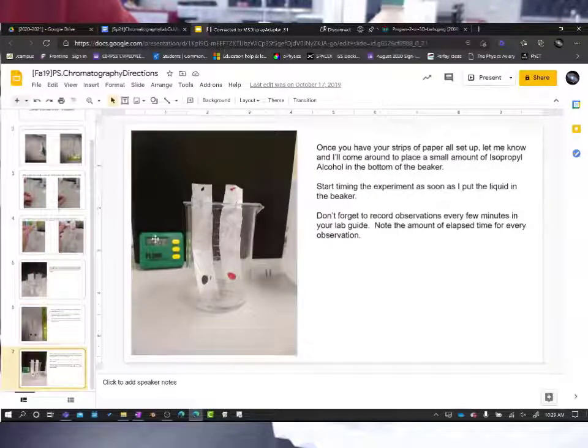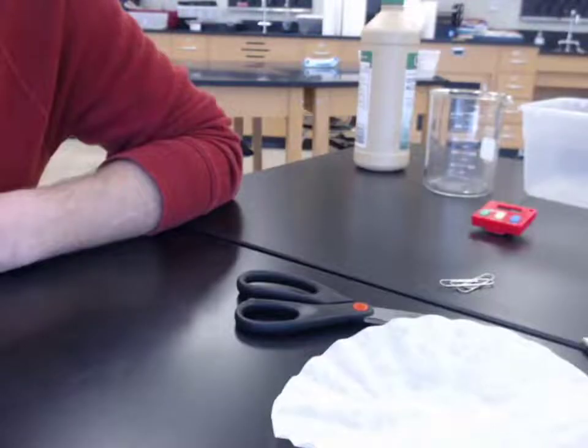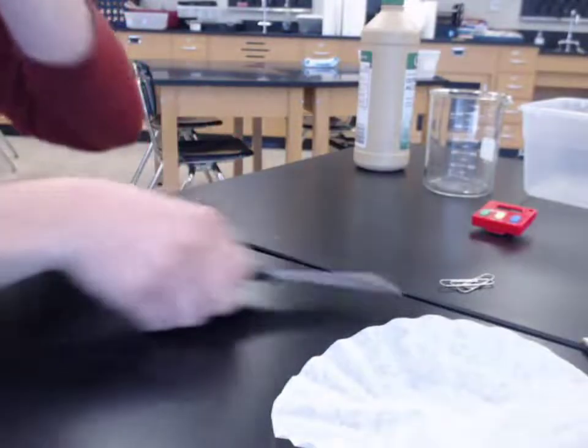And once we're ready to go, we'll have our timer going in the background. We'll just have a digital one going in the video. And of course, you can go back to a previous part of the video if you're missing any of your observations. So let's get things rolling here.